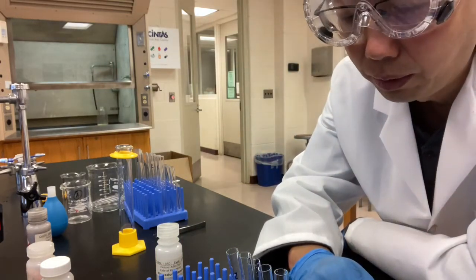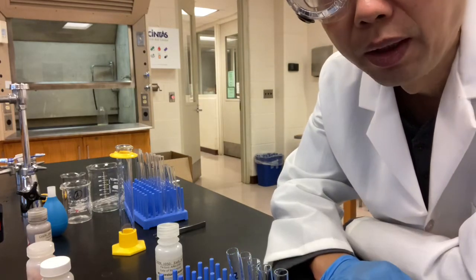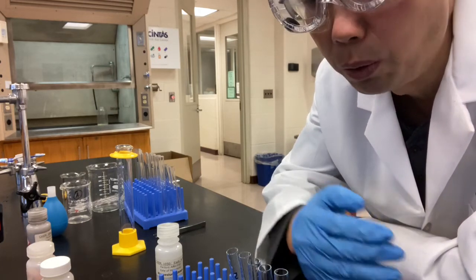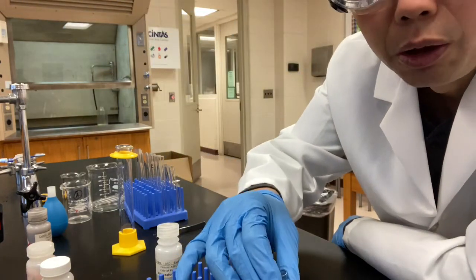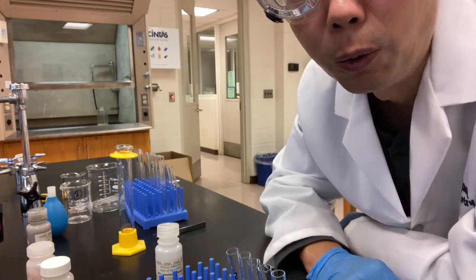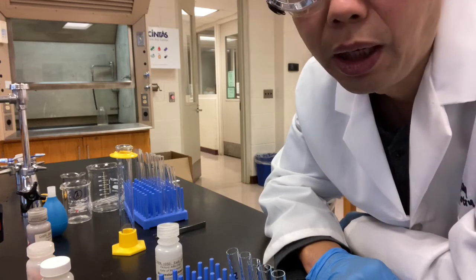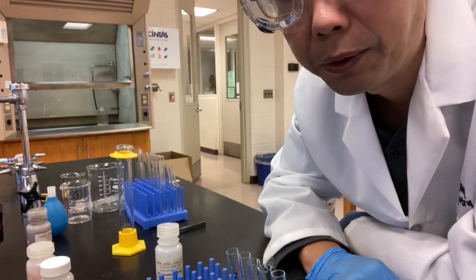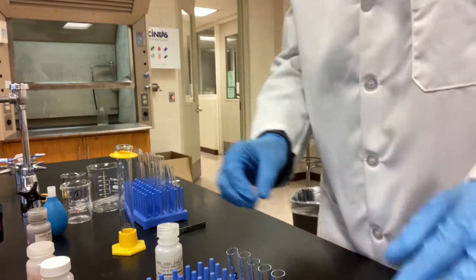Well, how can we do that? If these acids react with the magnesium, hydrogen gas will be produced. Hydrogen gas will be produced from the solution, and what you see is bubbles coming out. So we're going to observe the rate of the bubbles, just eyeballing which one reacts faster. I'm going to add 1 ml of the acid to each test tube.